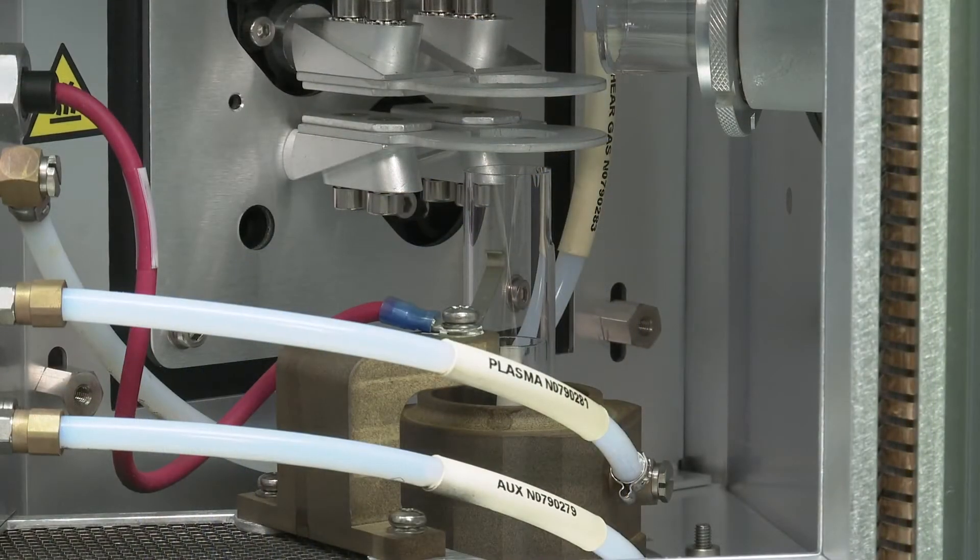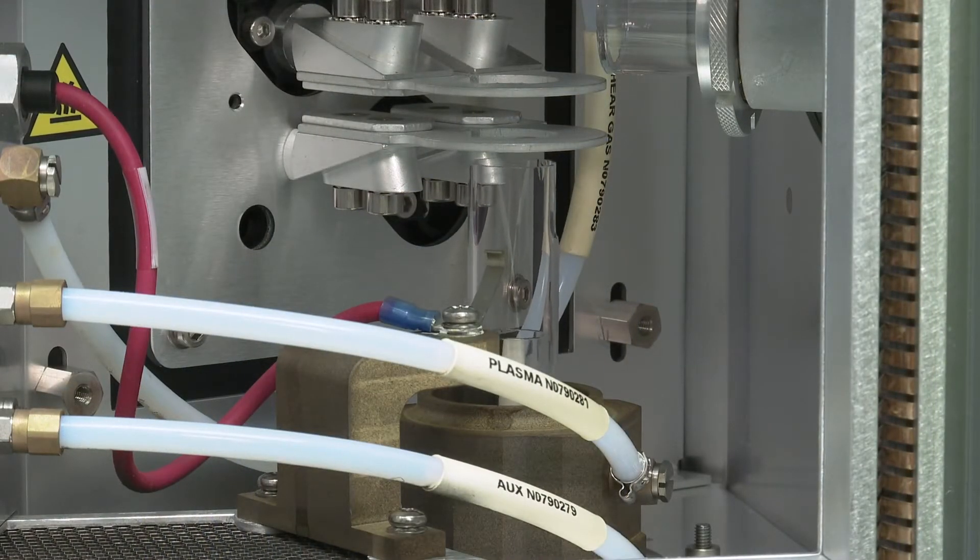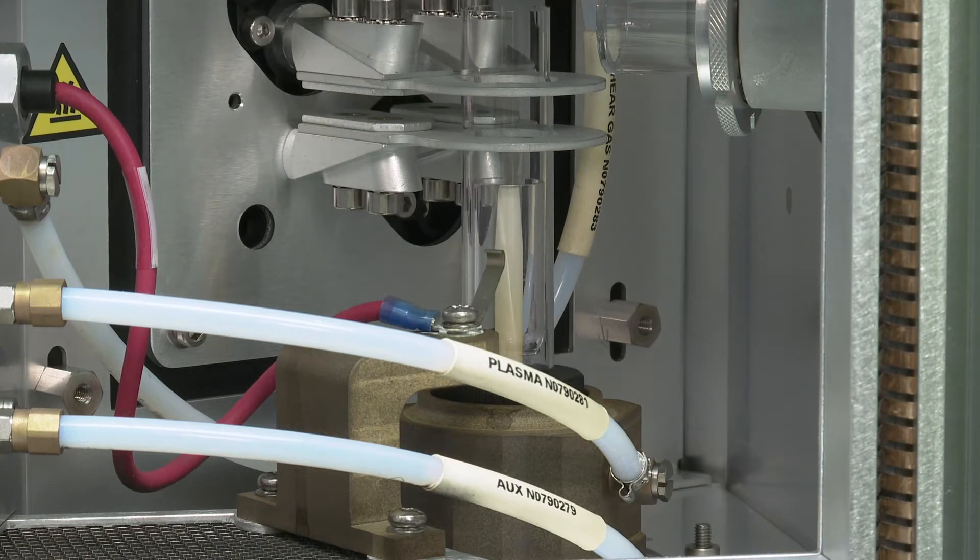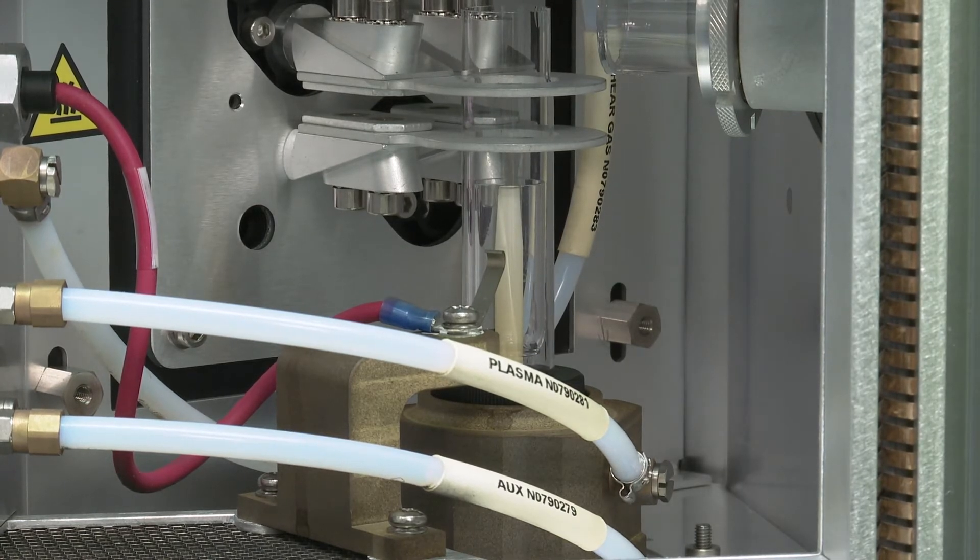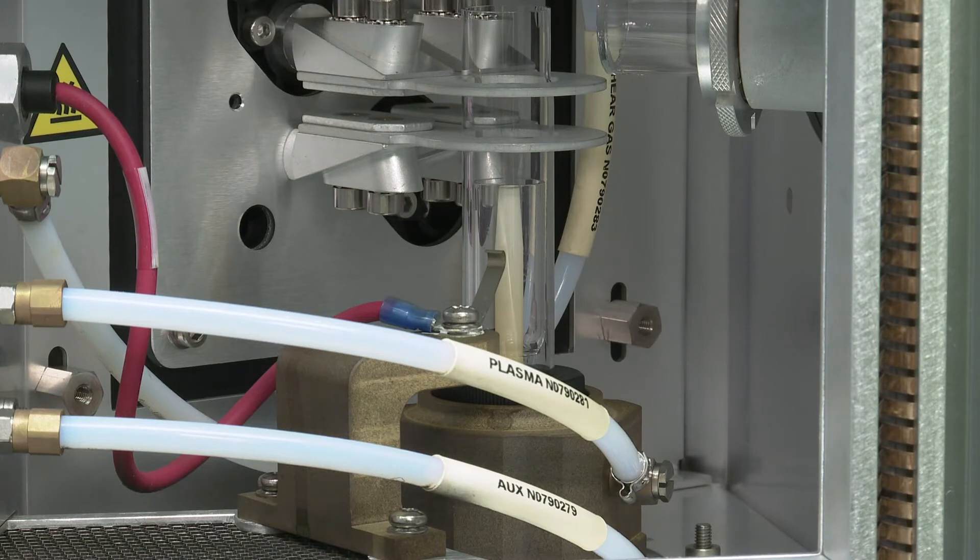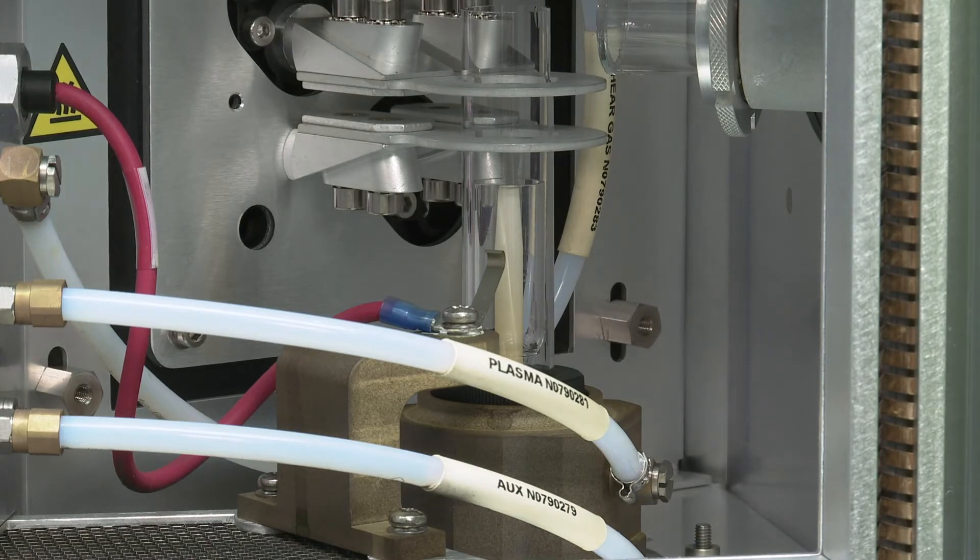While pushing the torch module slowly upward into the torch mount, be careful to keep the torch glassware centered in the induction coil. Continue to push the torch module upward until it's fully seated.